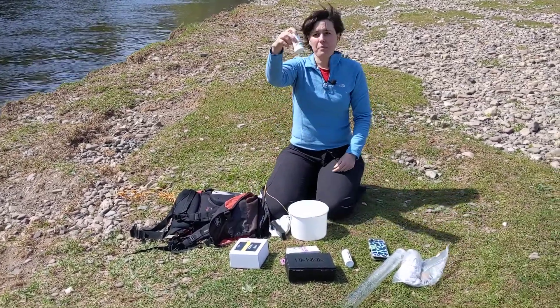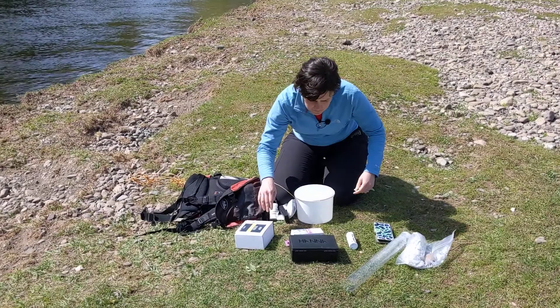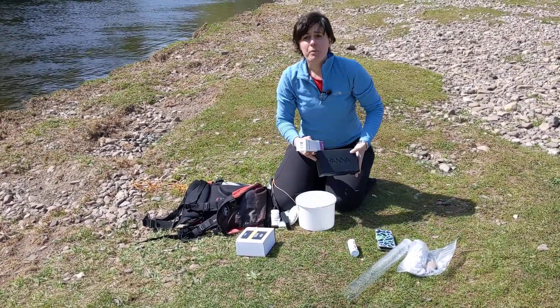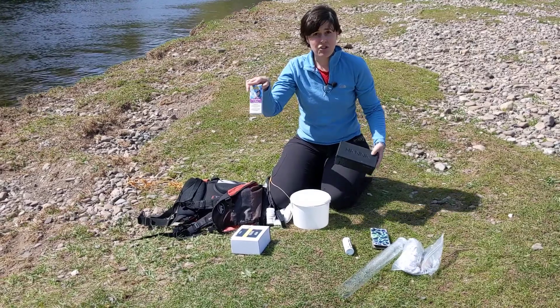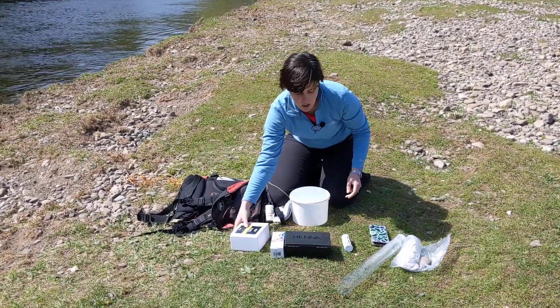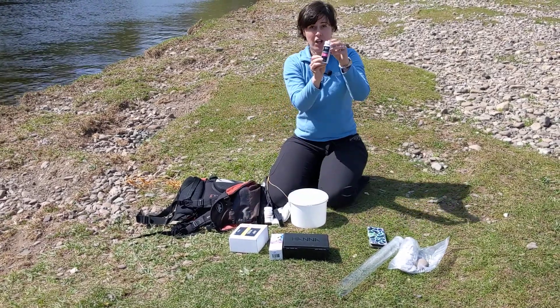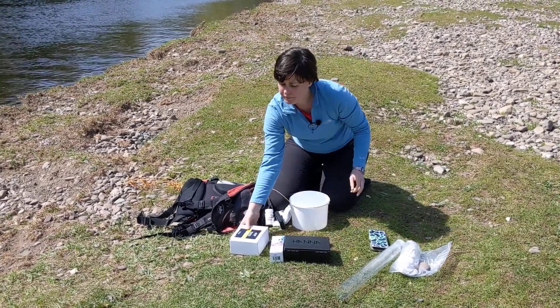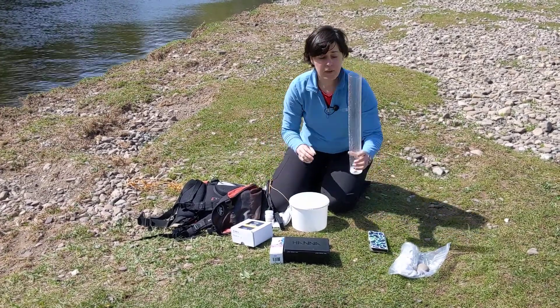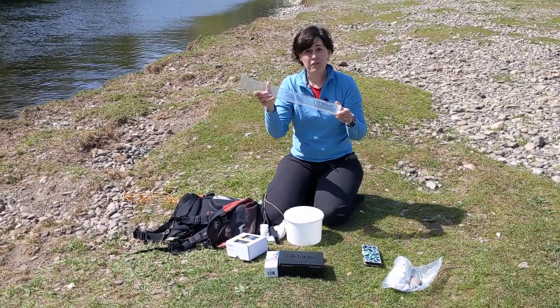My pH test strips, my phosphate measurement method — you might either have test strips or a Hannah Checker kit. You may have nitrate test strips, ammonia test strips, and you may also have a Secchi tube for turbidity.